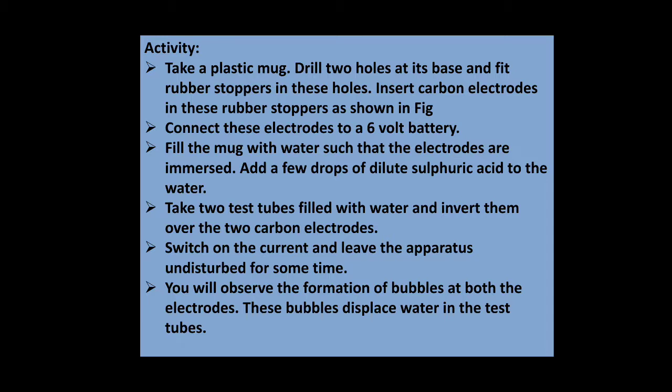Switch on the current and leave the apparatus undisturbed for some time. You will observe the formation of bubbles at both electrodes. These bubbles displace water in the test tube.